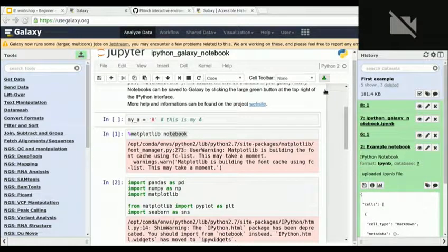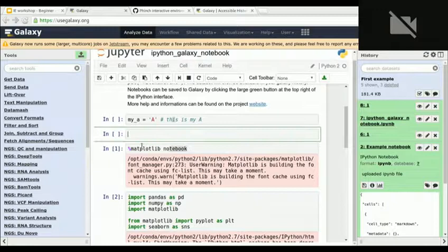Passed in where? When we launch the container, we give the container your authentication in terms of an API key. Okay, so when you do the BioBlend opening, then you already have the keys. Yep. As you'll notice, the key does not appear anywhere in the notebook, so it is safe to share your notebooks around without worrying about compromising your account.